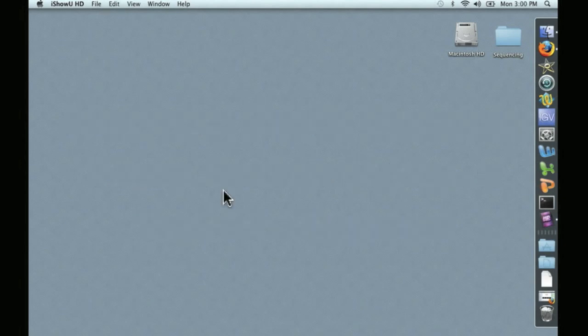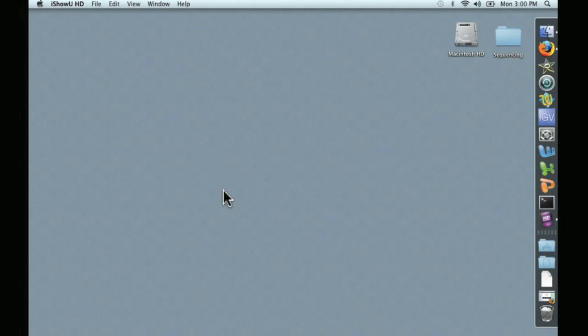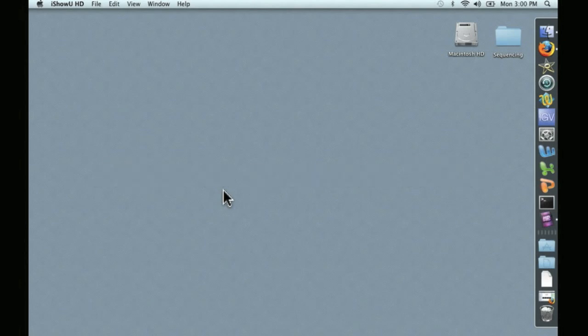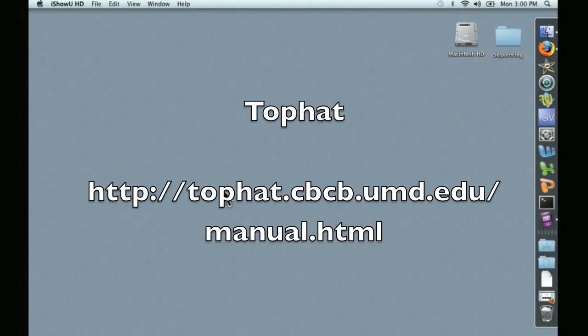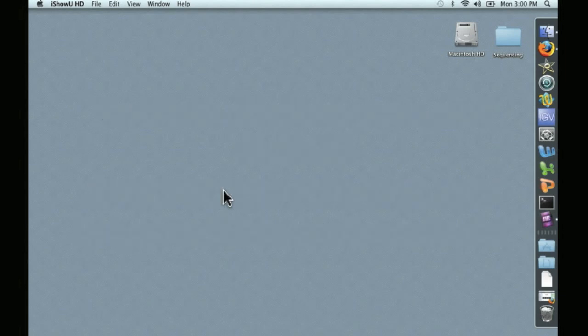In this video, we're going to take two publicly available RNA-seq datasets from an experiment on rice, go through an alignment to genomic DNA using a program called TopHat, and then using a suite of software called Cufflinks, CuffCompare, and CuffDiff, we're going to perform an actual statistical analysis looking for differences in gene expression between these two datasets.